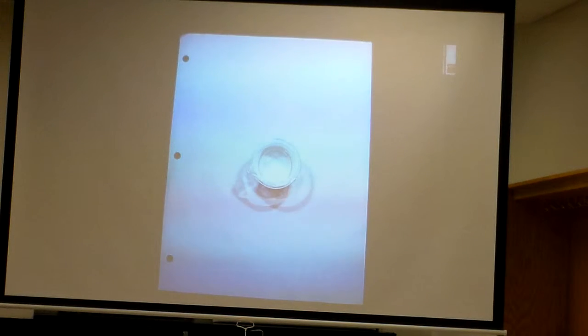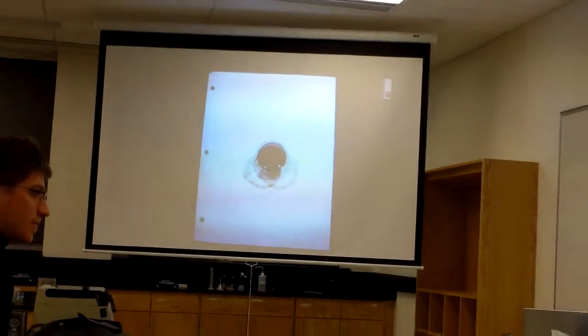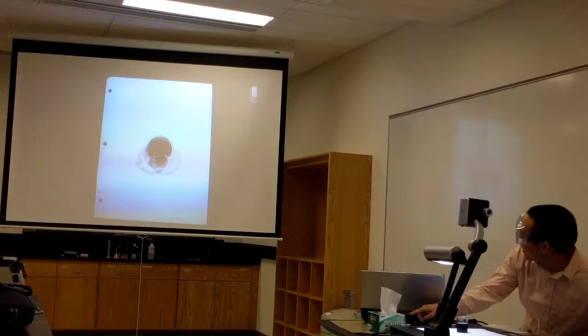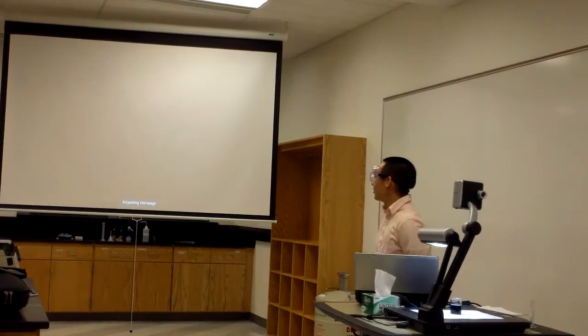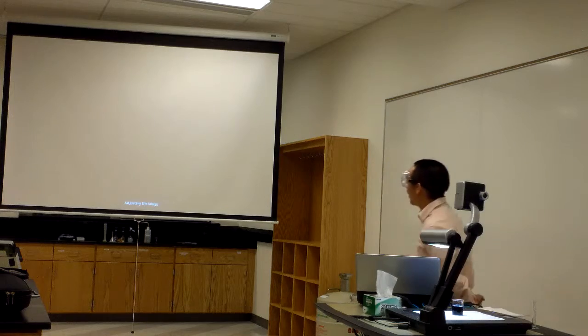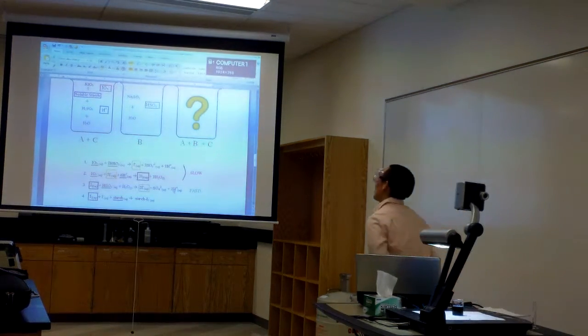When you do this demonstration for your class, you can vary the amounts to get different effects, but I'm not spoiling anything for now. This side. Whoa! And all of a sudden. Okay. So moving back to this side. Yeah. I thought it was going to gradually change colors. No, that's... So what is going on here?